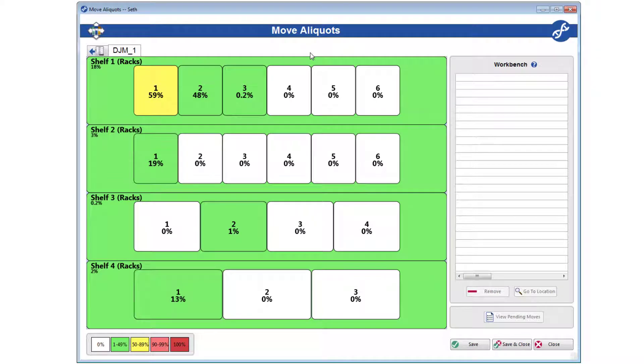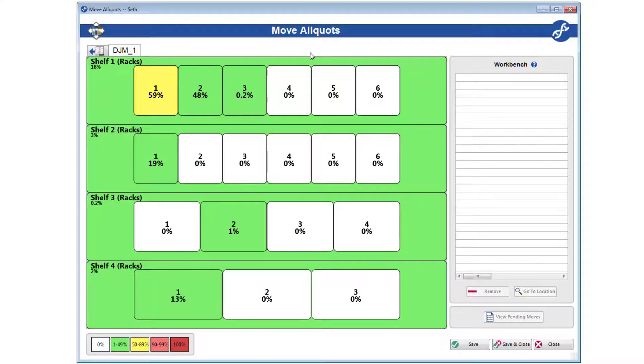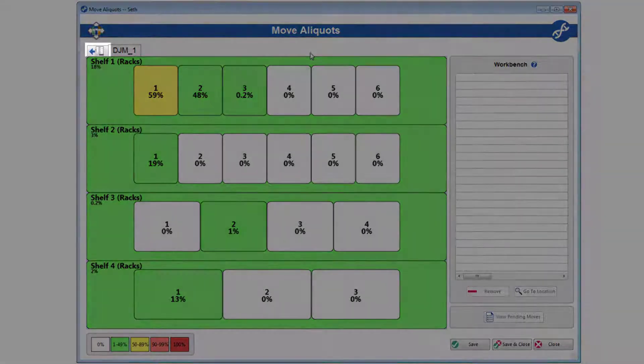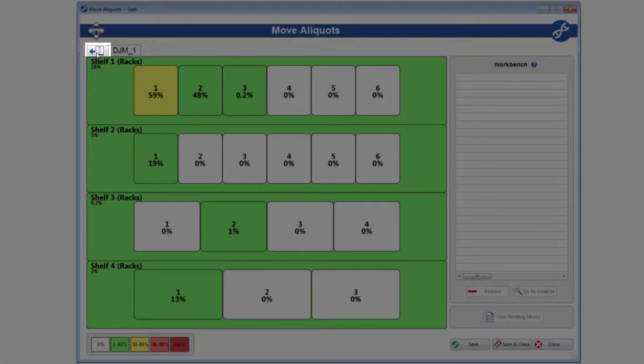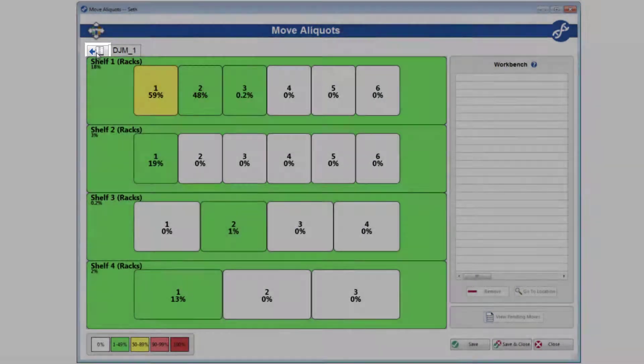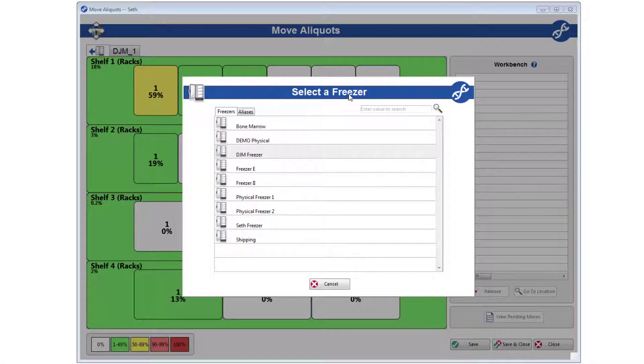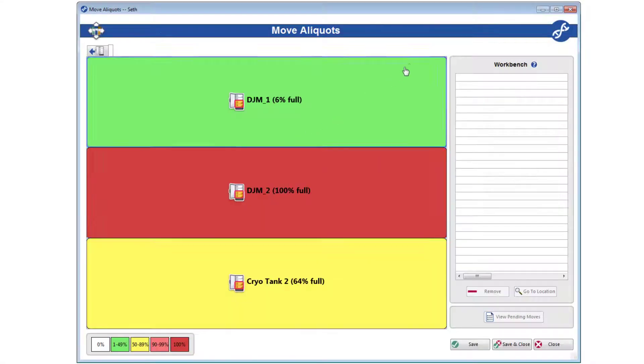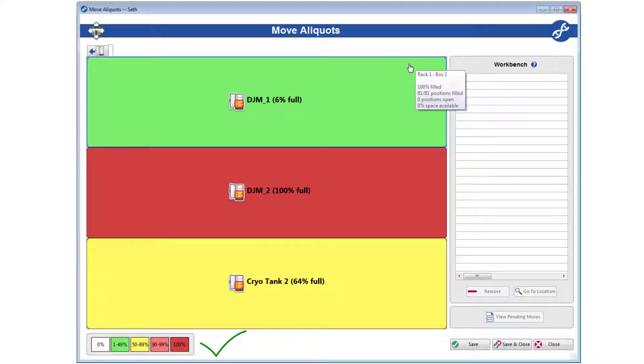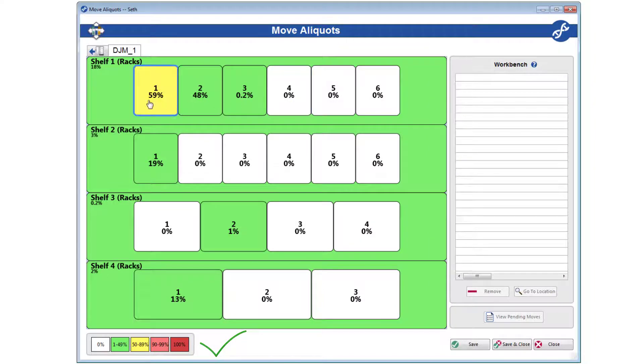However, the visual interface does differ from explore freezers in a few ways. Whenever you need to open a new freezer, freezer section, or alias, click this special tab in the top left corner of the picture. This will open the overlay that we started with. Freezer capacity is also always turned on in Move Aliquots, as we believe it is indispensable to the moving process.